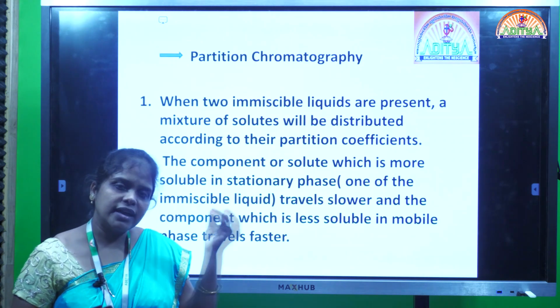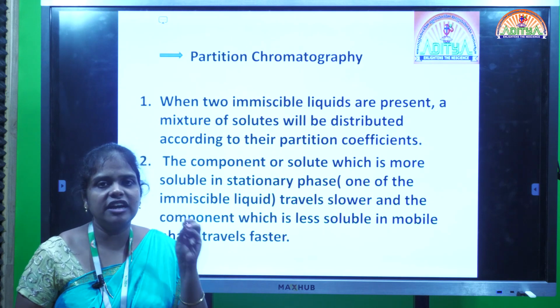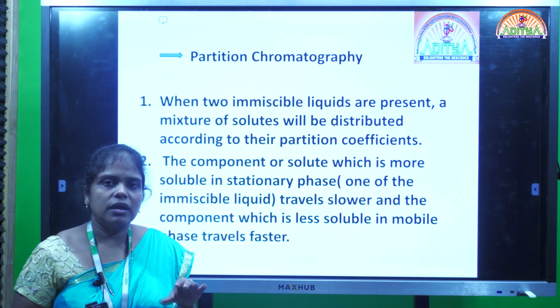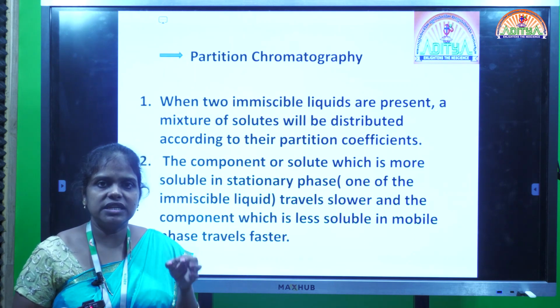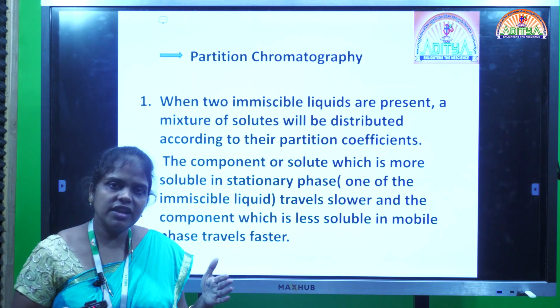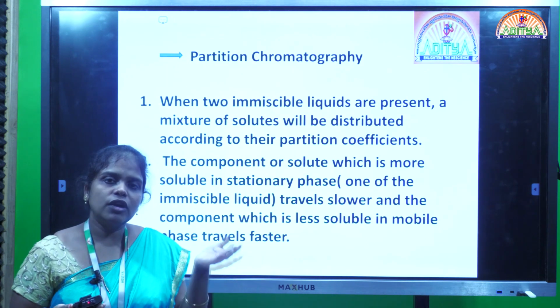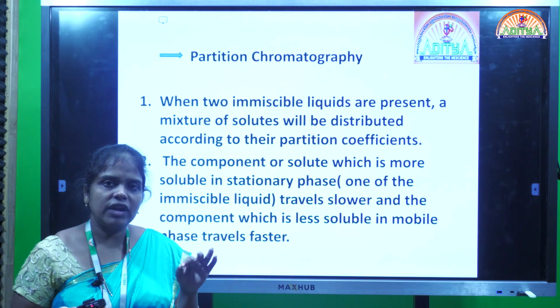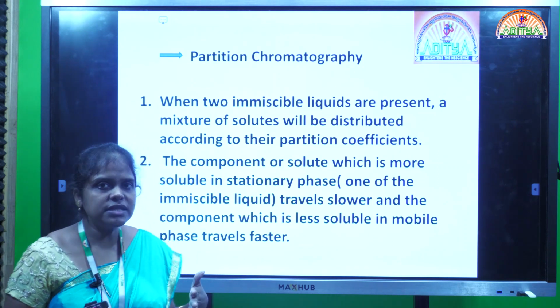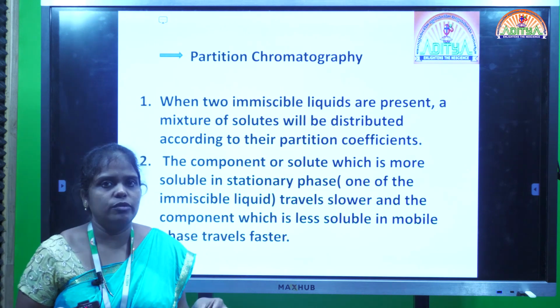When we add another mixture or compound which we are going to separate into this oil and water, if the components present in that compound have more solubility in the oil, they will solubilize or mix with the oil. If the components have more solubility in water, they will go with the water. That means in partition chromatography, the main principle of separation is solubility.